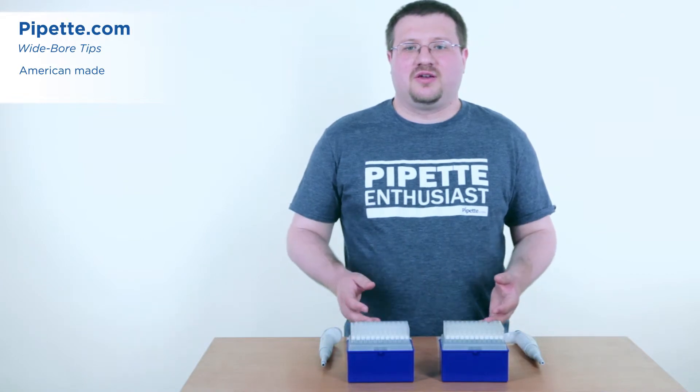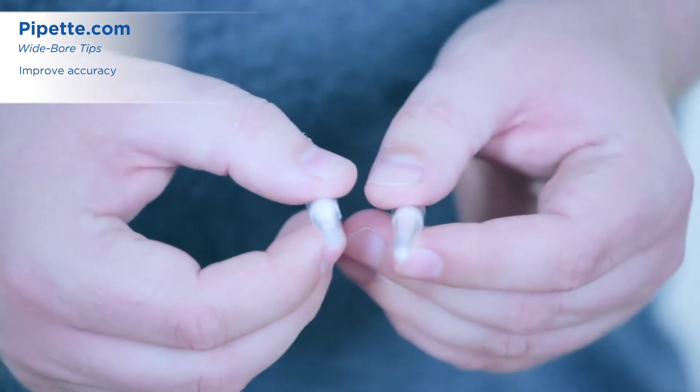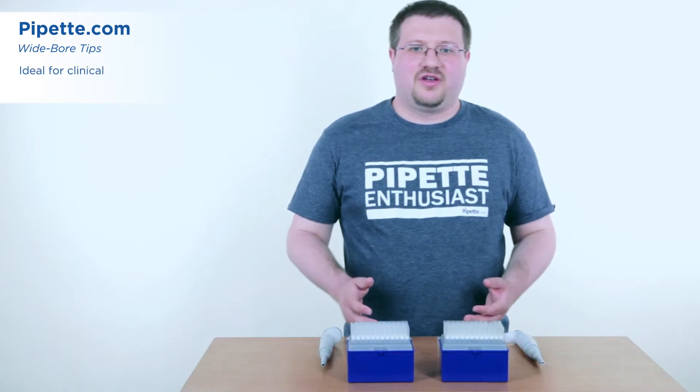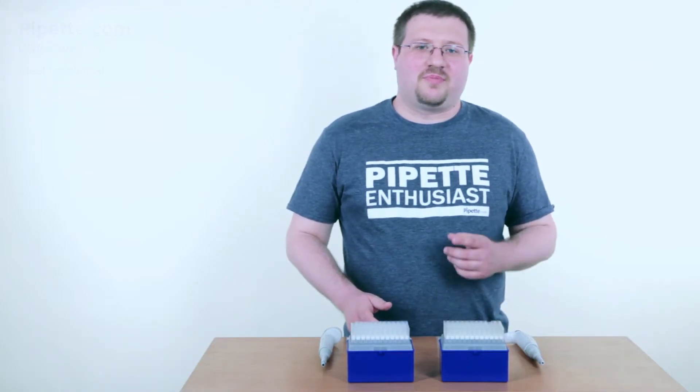These American made tips are available in non-filtered and filtered formats. They're great for clinical applications and pipetting sensitive organelles. Request your free samples at Pipette.com today.